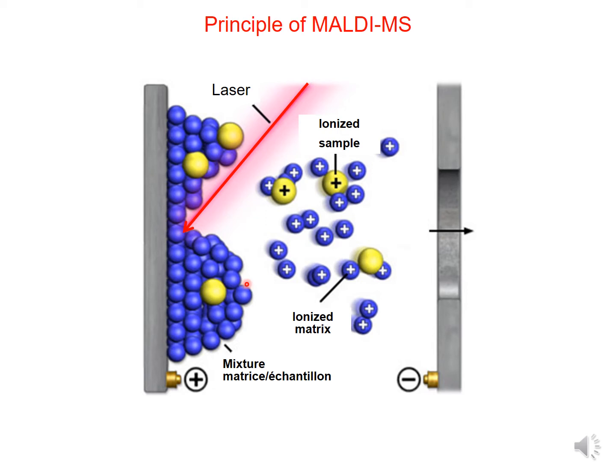This is also the desorption phenomenon, meaning that here you have a solid phase, and because of the heating by the laser, you obtain a gaseous phase here. After that, you perform the analysis of your molecules, because here you have all the ionized molecules, and you need to perform the analysis of the molecules in the analyzer. So here you have a lot of funnels to extract, to accelerate, and to focus the molecules, and after that to go to the analyzer.